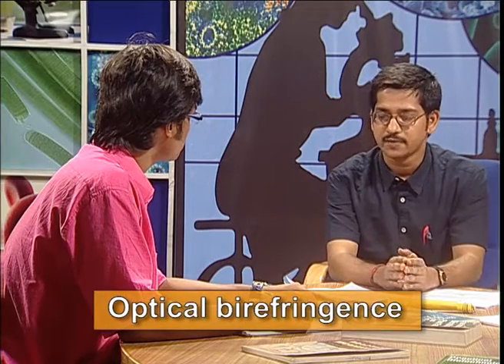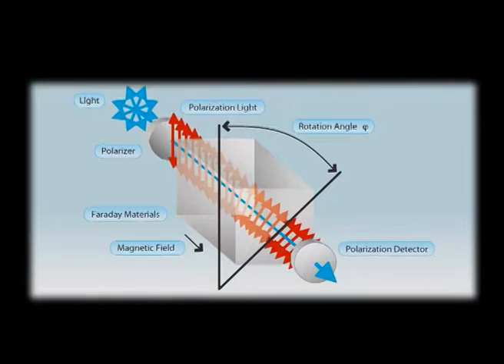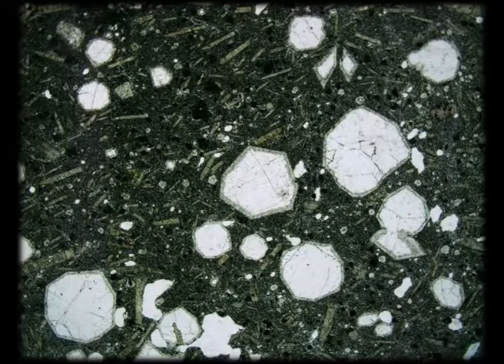Now, optical birefringence is normally defined as double refraction of light in a transparent, molecularly ordered material, which is manifested by the existence of anisotropic substances having definite crystal axes. So what is an anisotropic substance? An anisotropic substance is such where the different faces have different axes.